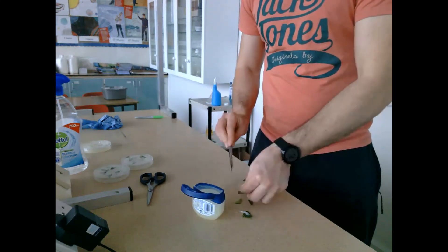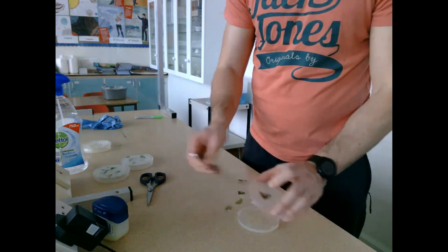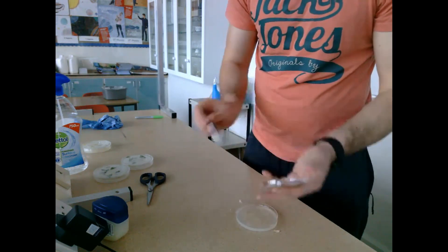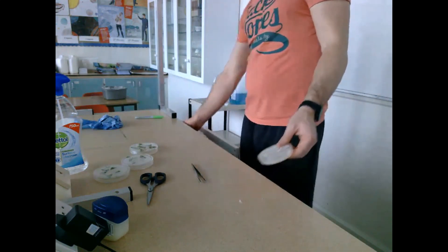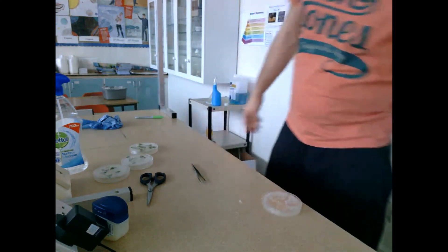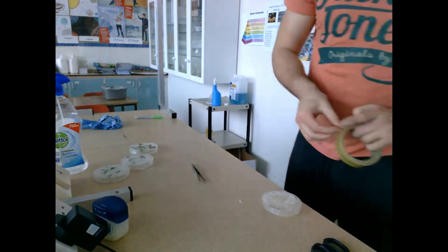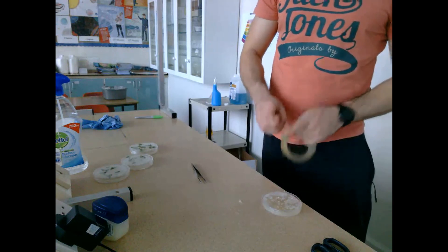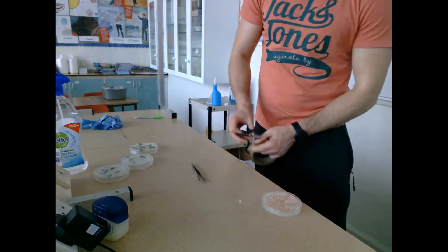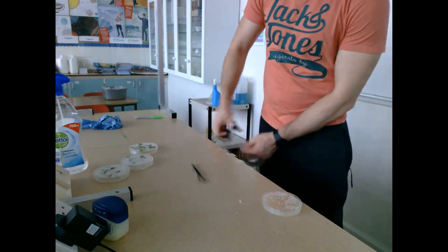When sealing these plates, I don't seal them fully. If you seal them fully it can be quite dangerous, because anaerobic bacteria or fungi can develop and they can be quite harmful. Instead, we get a bit of sellotape and put two small pieces on either side to keep the lid sealed, but not so sealed that oxygen and air can't move in.